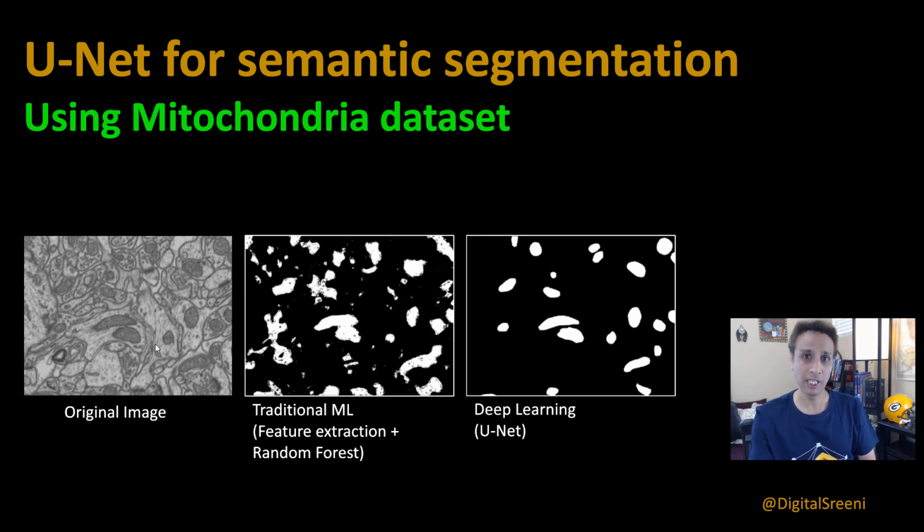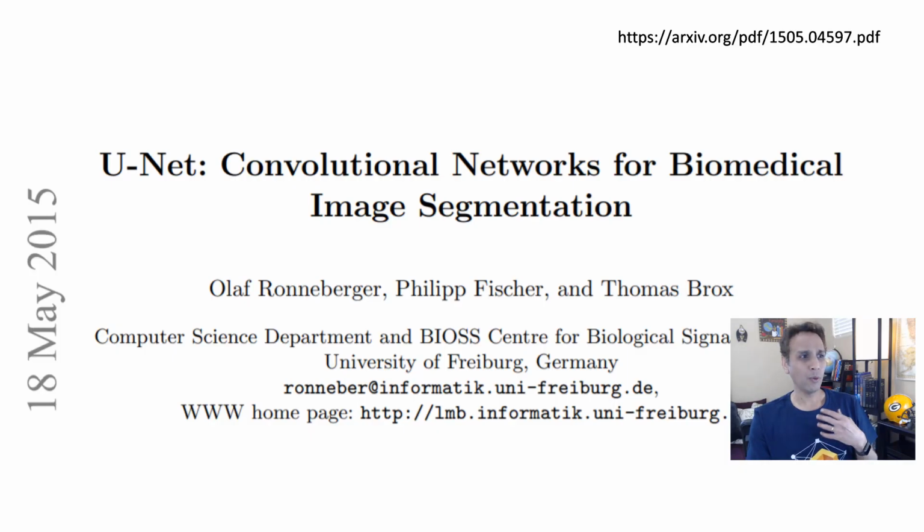electron microscope images. Now, this is an example with electron microscope images, but this does work with most types of, obviously, biological images, but also if you are doing drone imaging or remote sensing imaging in general, UNet can be a great architecture.